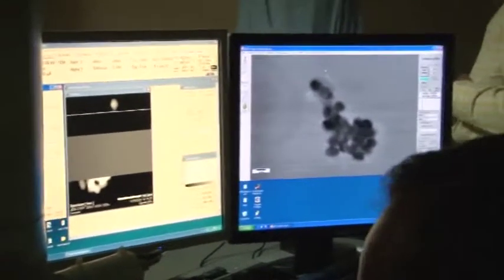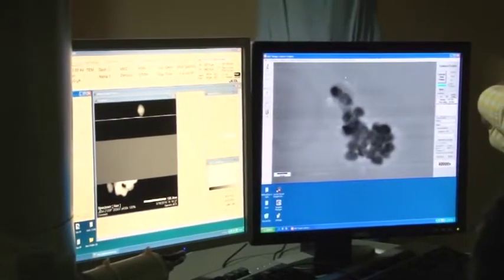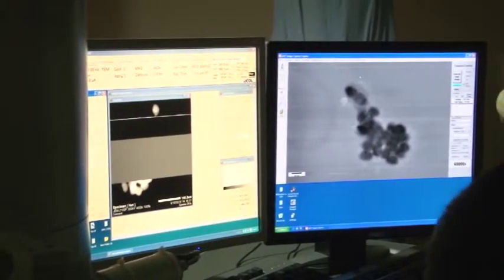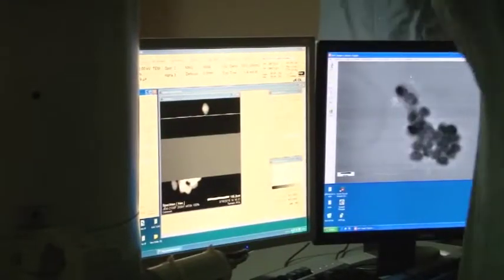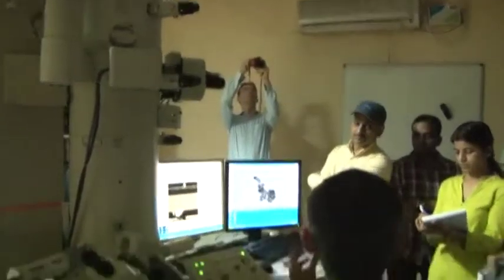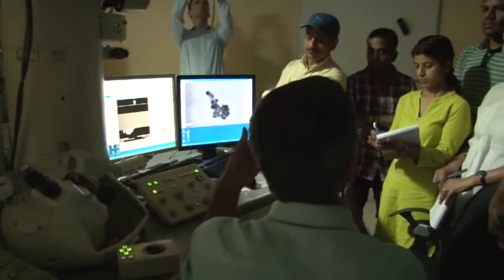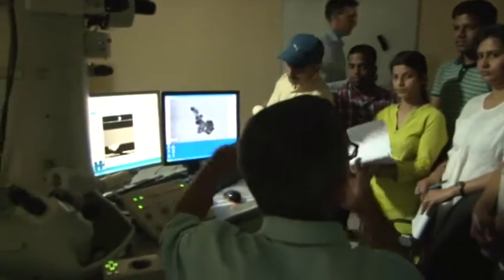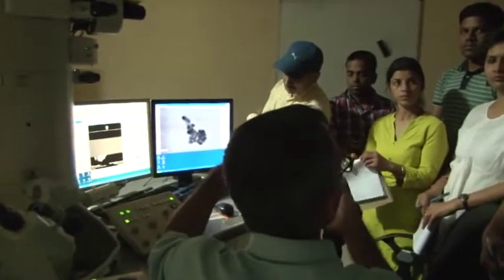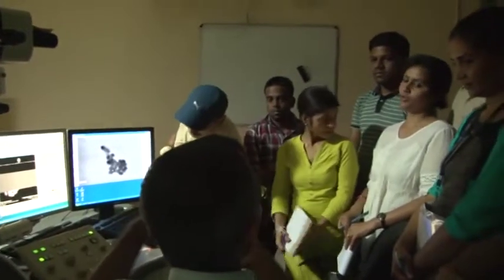Yes. So this one is brightness, not exactly numerical aperture, I would say. So this is the brightness knob, and this brightness knob is directly connected to the condenser lens system, which is here. If I change the focus, or the excitation, of the condenser lens, I can make my beam converge. If I make the condenser lens very strong, then it will converge the beam.